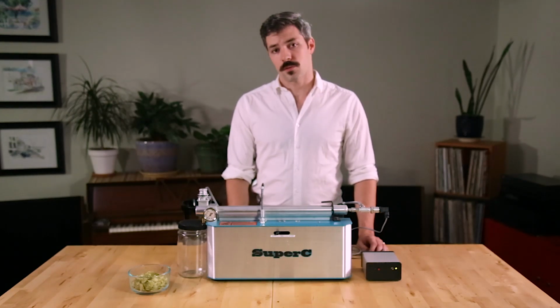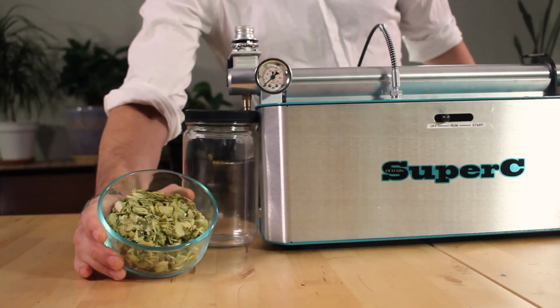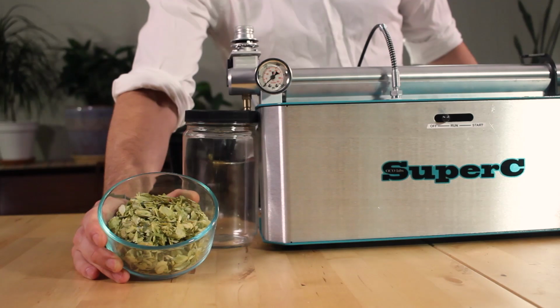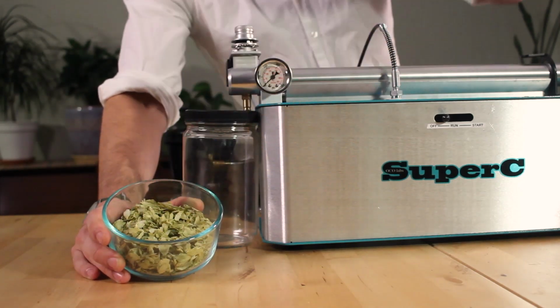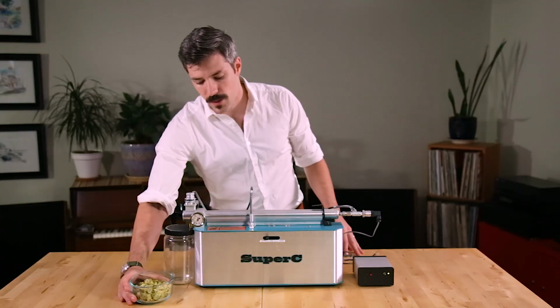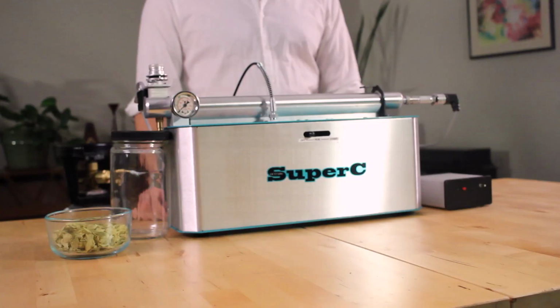Another thing to note is particle size. If you're using a dry, leafy product like hops, you should be able to crunch it by hand to get it down to a small enough size. If the material you're using is thicker or is otherwise denser, you may want to consider grinding it with a coffee grinder or a milling machine. Somewhere between 1 and 3 millimeters is an ideal particle size.